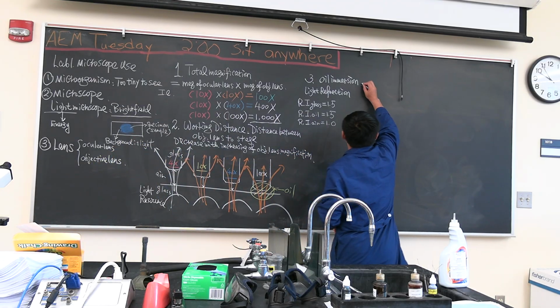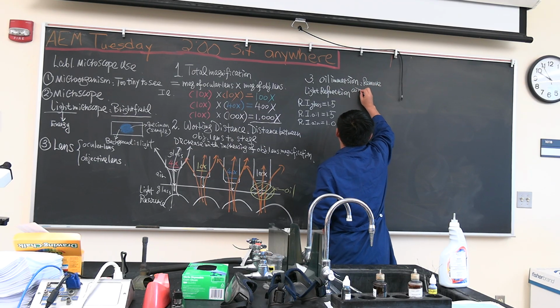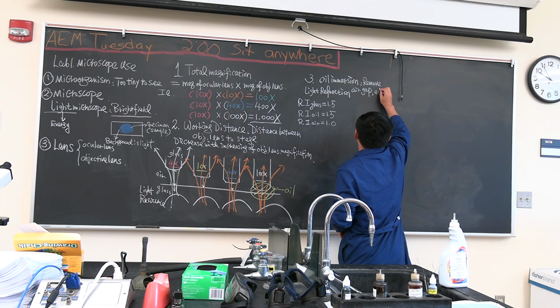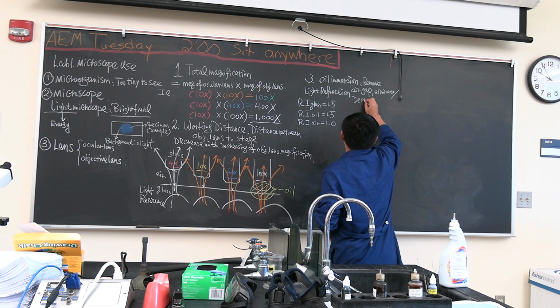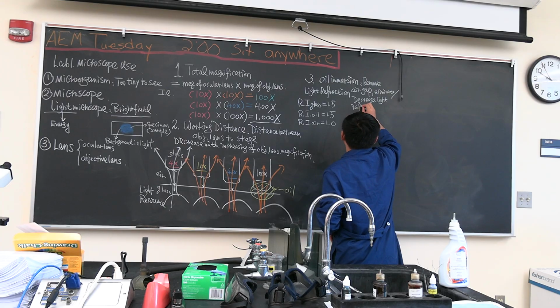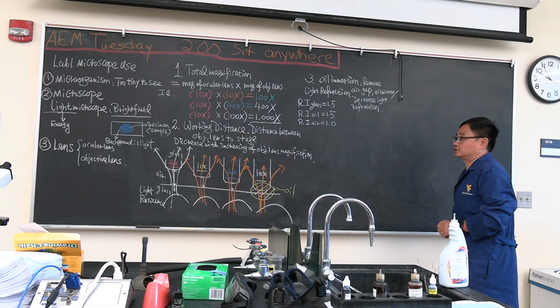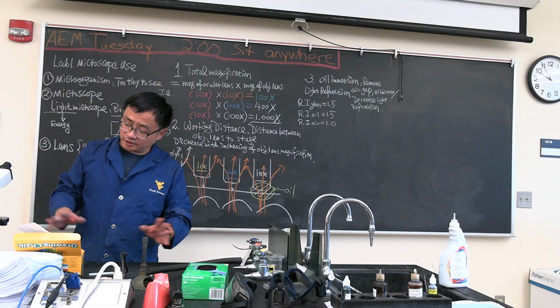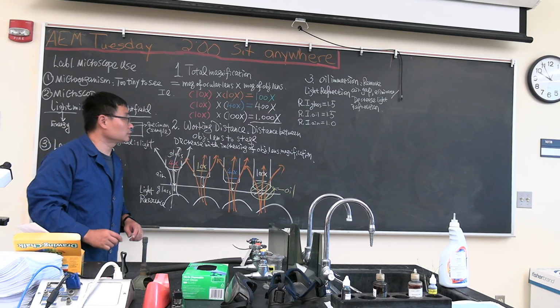So what is oil immersion? Remove air gap. Or we say eliminate or decrease light refraction. So that's a third terminology. It is very important. Okay? Now, we talked about magnification. We talked about oil immersion.